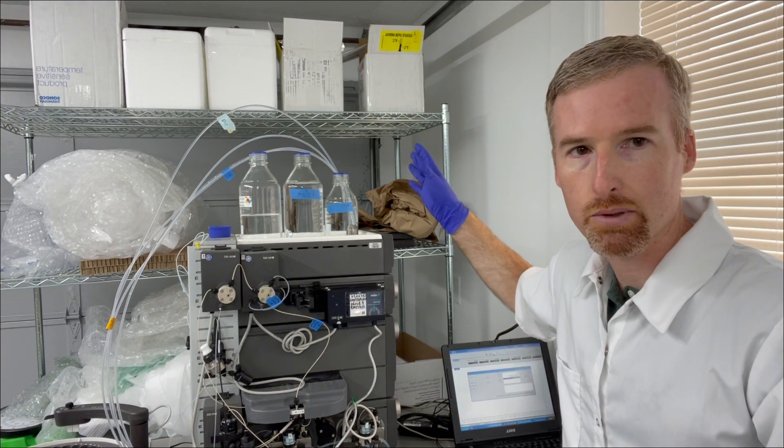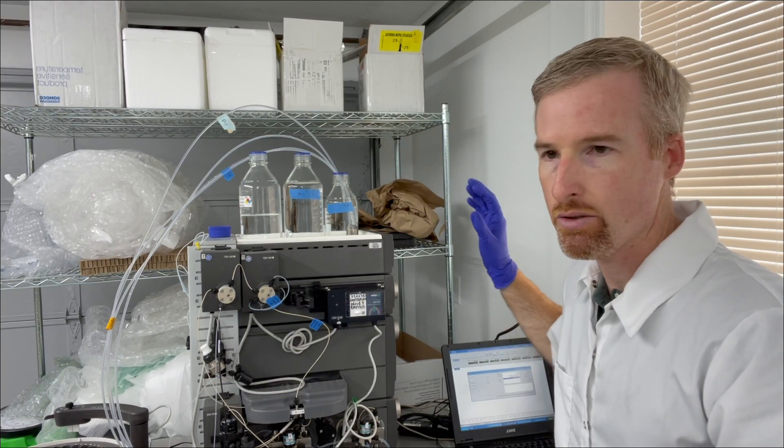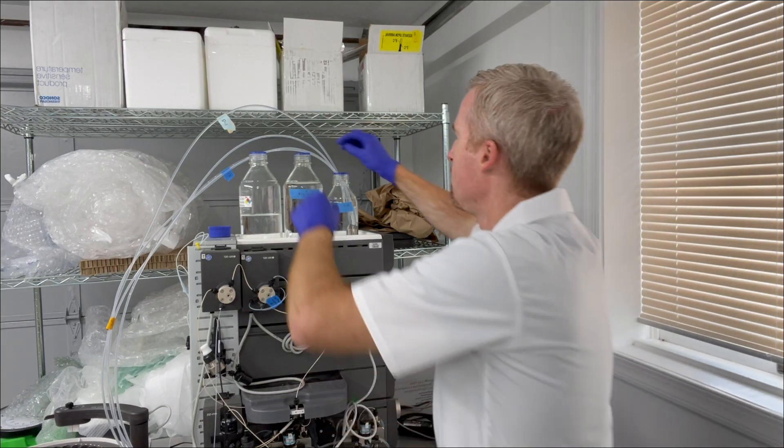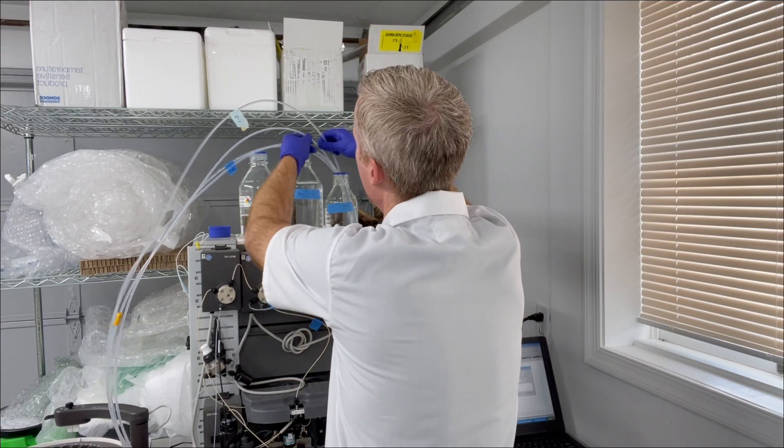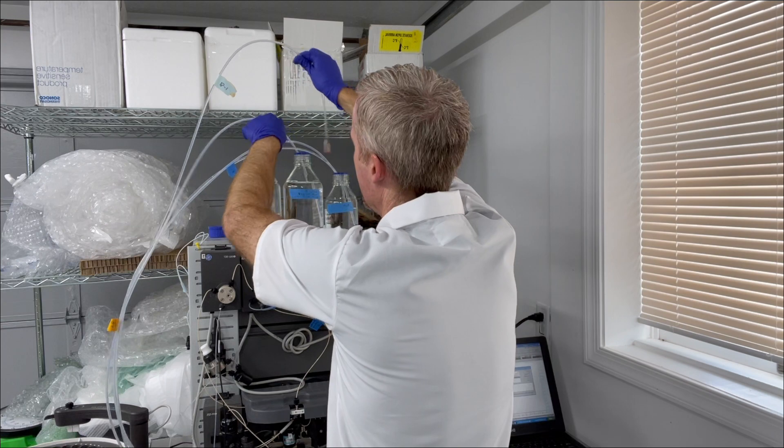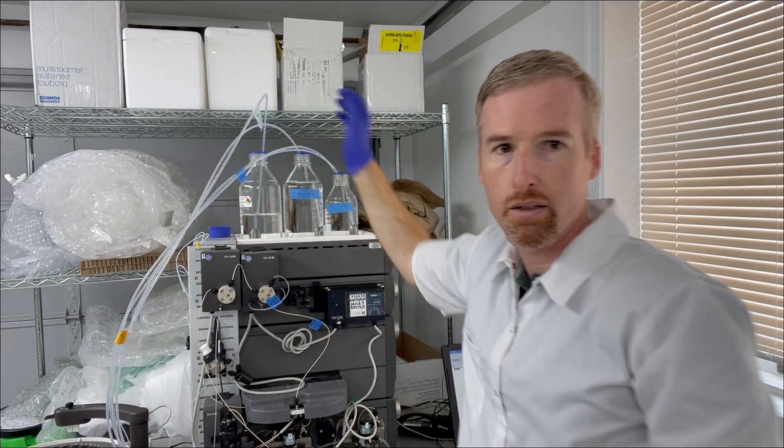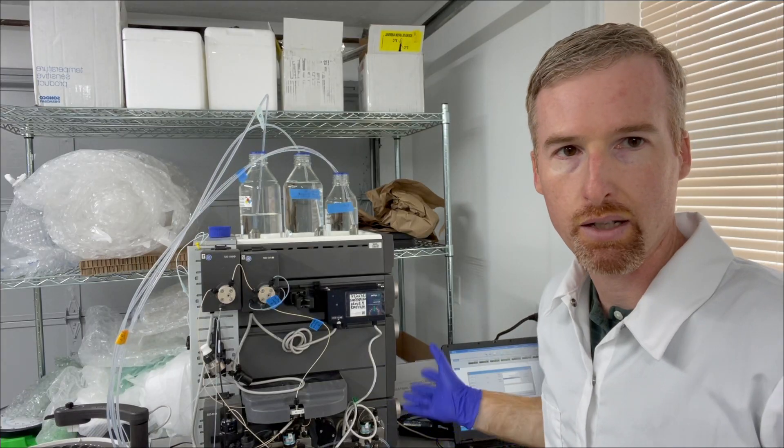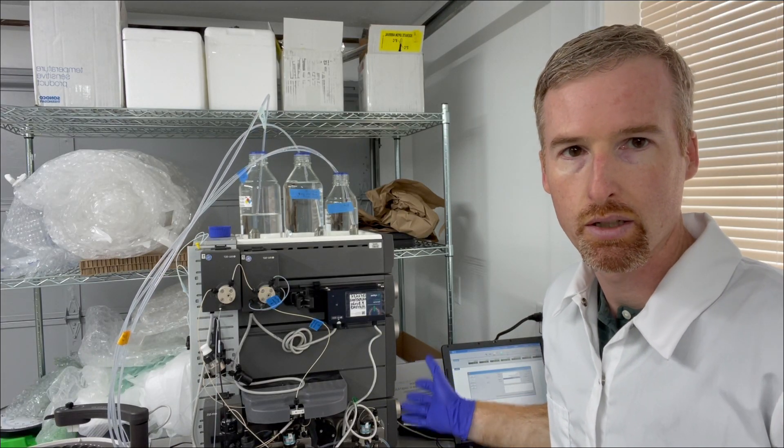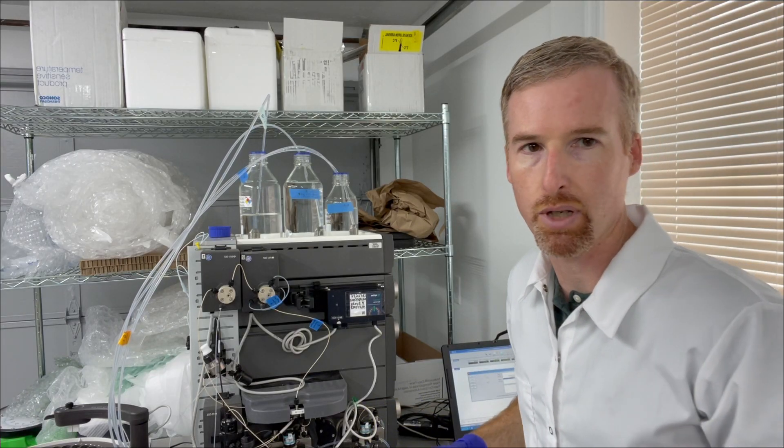I'm going to move the line labeled A1 into Buffer A and the line labeled B1 into Buffer B bottle, and then I'm going to use the automatic FPLC method. It's called pump wash. It's going to pull just enough buffer into the lines to fill the pumps.